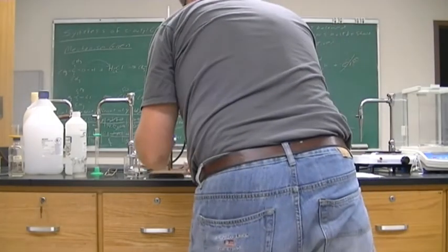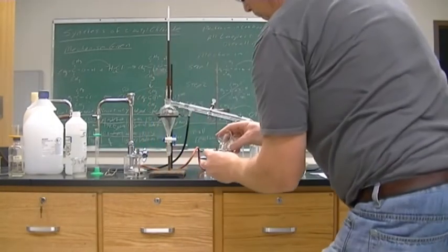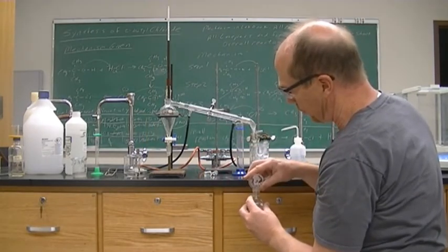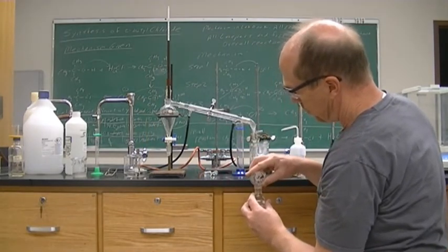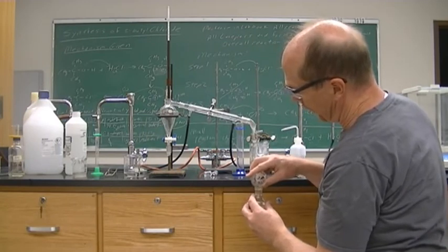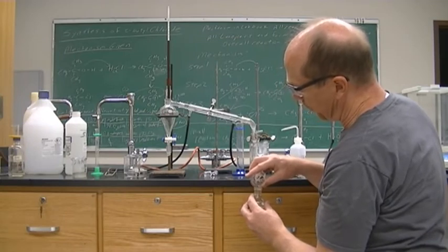I know distillation with this amount is going to lose a lot of product, so I'm going to get a crude yield. I'm going to be considering this as my yield of the product, and I'm doing this distillation to purify it.